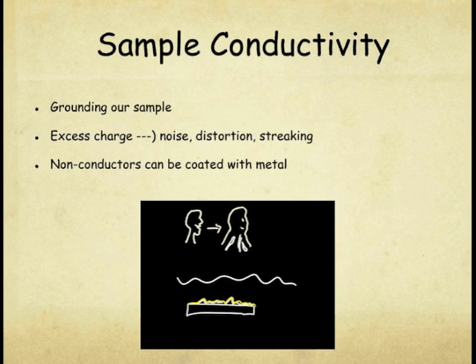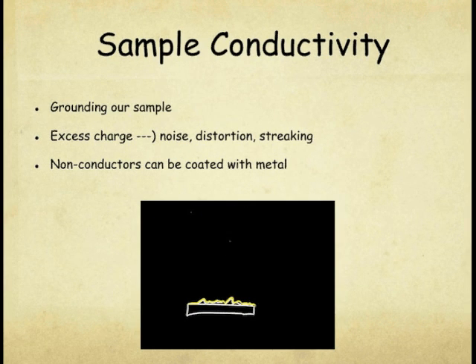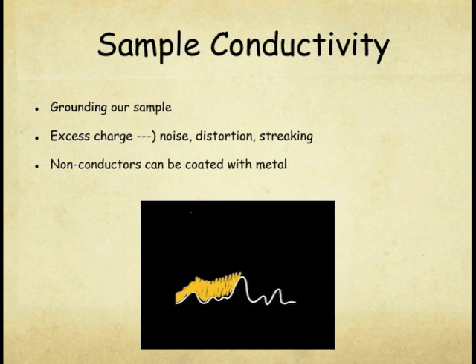Coating a sample with a thin film of metal and trying to image it is similar to putting a thin sheet over a person's face and then trying to make out the finer details. If the layer is too thick, we lose some finer details. If it's too thin, we have image artifacts produced by charging. So there is a constant balance between charging and actual sample modification.